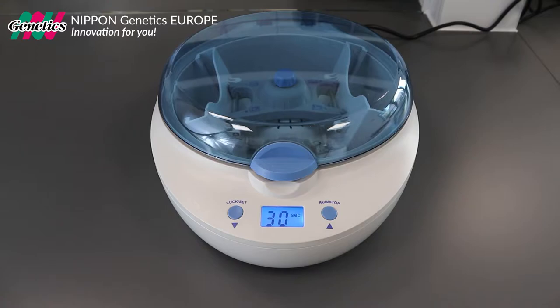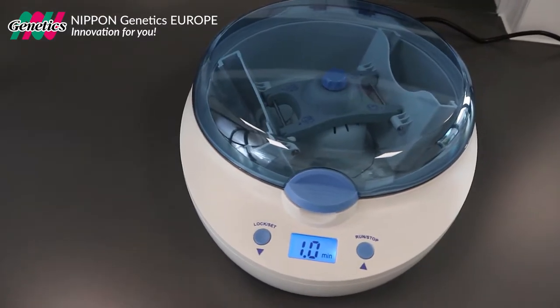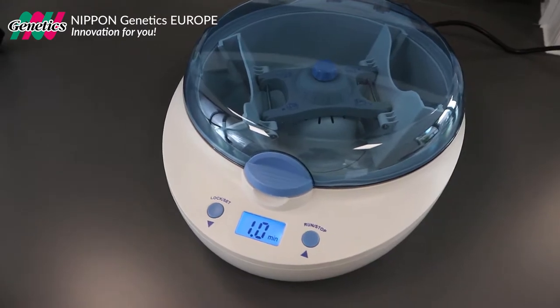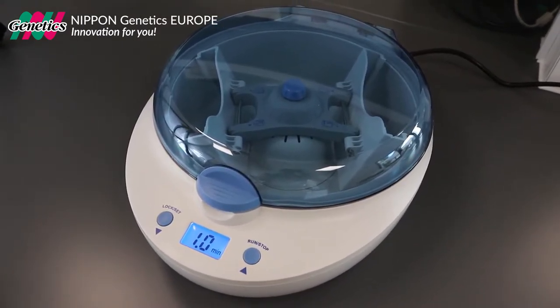The FasGene plate centrifuge was designed for quick and gentle centrifugation of various plate and tube types. The small footprint, simple handling and affordable price make it the perfect alternative to complex and expensive high-speed plate centrifuges.